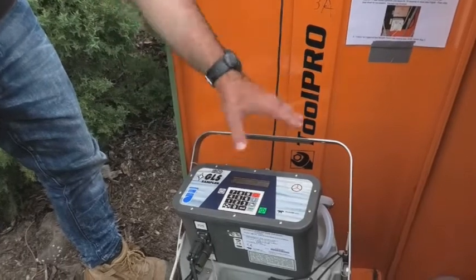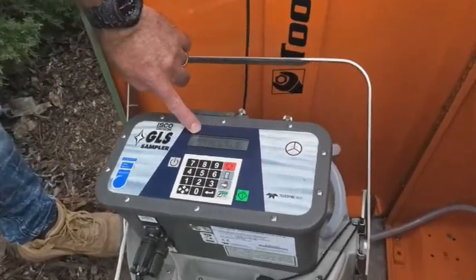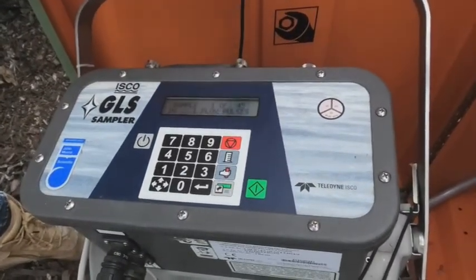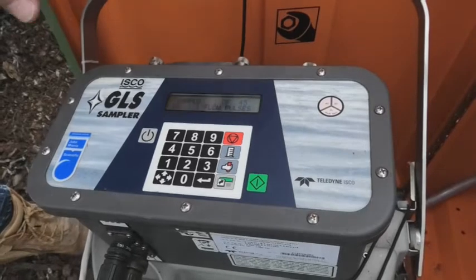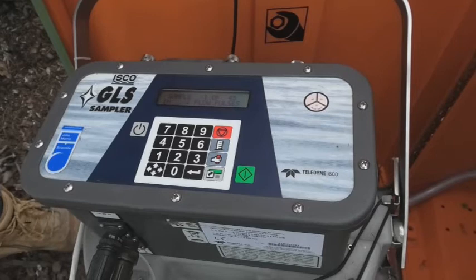So when you come to site, if it's taken samples, you'll generally see a display at the top here that says sample X of 45 samples, or however many samples you set it up for. In this case it says one because it hasn't taken samples, but it might say eight, nine, ten, whatever.